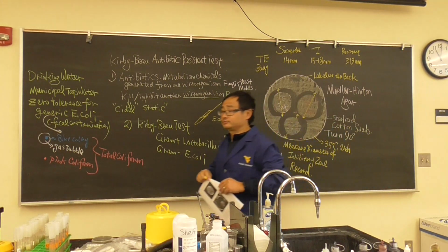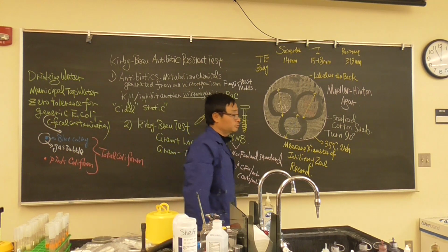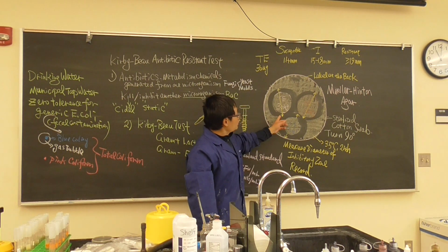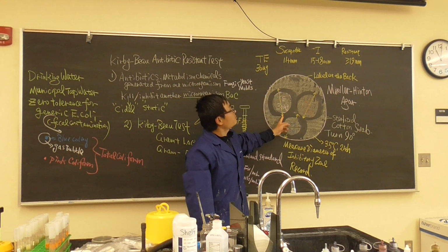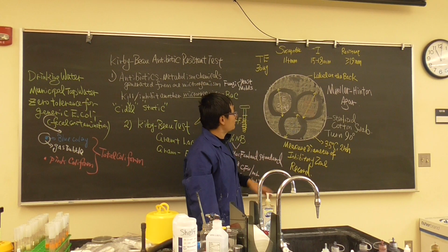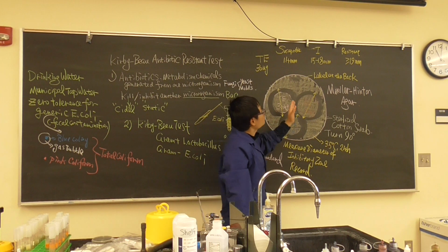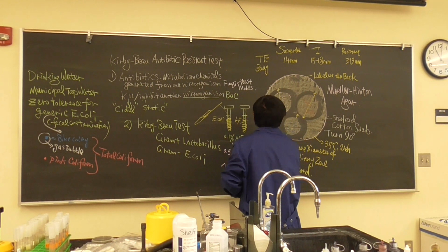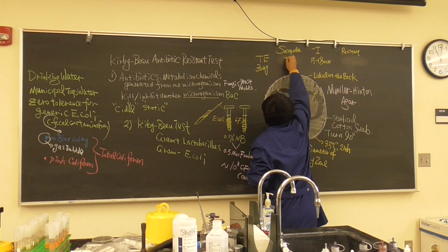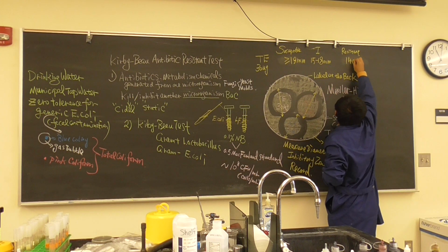So what does this mean? On Thursday, you're going to measure the inhibitory zone and just record it in your notebook. Then next week, Tuesday, we can talk about that. Sorry, I made a mistake. This is more than 19 millimeter, and this is 14 millimeter.